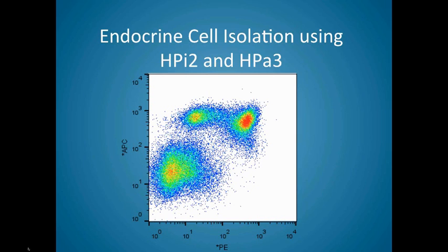You may see something quite different if you're looking at cells, or islet-like cells, generated in culture. That may be because their transcriptomes or proteomes may be somewhat different than cells derived from islets. So I just wanted to let everyone be aware of that. I actually hope someday we can have someone look at these reagents using beta-like cells generated in culture and then transplanted to xenogenic animals and look at the outcome from those transplants. That would be quite exciting.